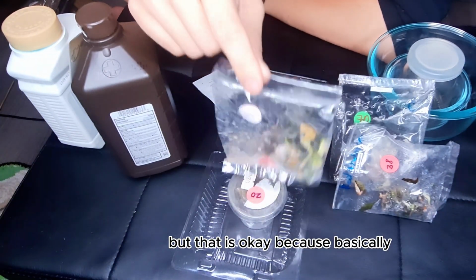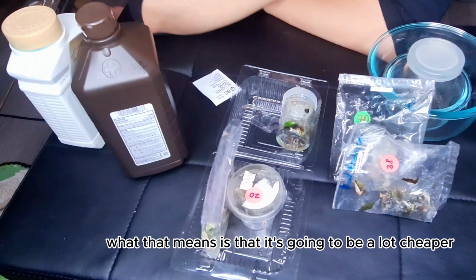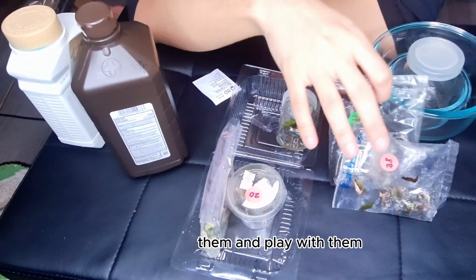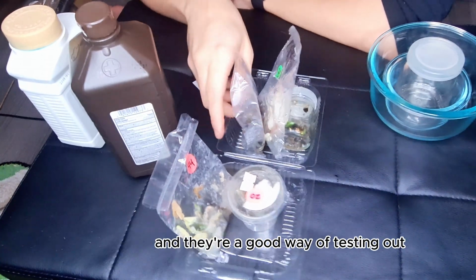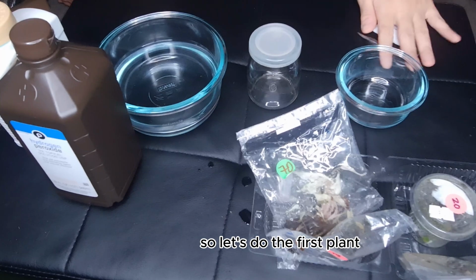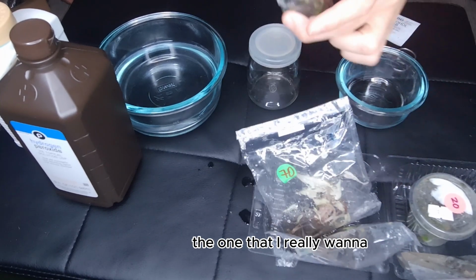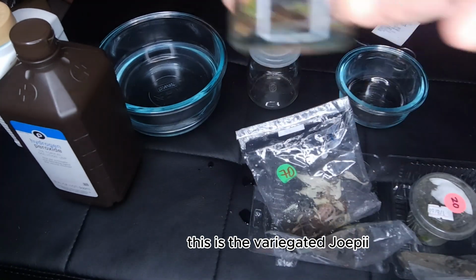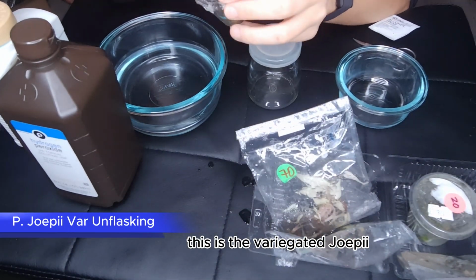But that is okay, because basically what that means is that it's going to be a lot cheaper for me to be able to purchase them and play with them, and they're a good way of testing out tissue culture. So let's do the first plant, the one that I really want to make sure is doing really well. This is the variegated Joepii.